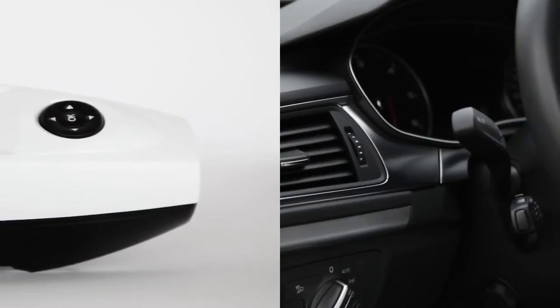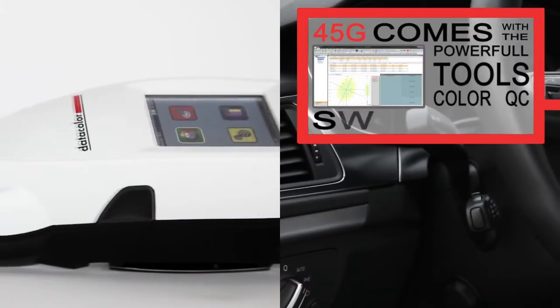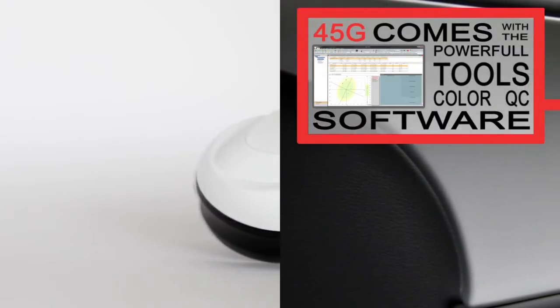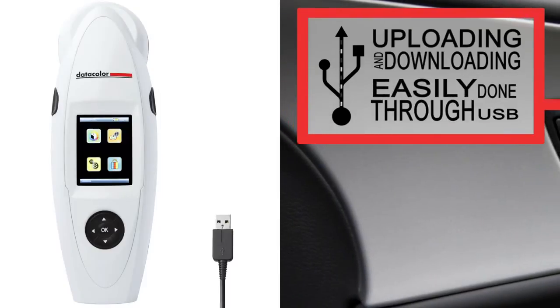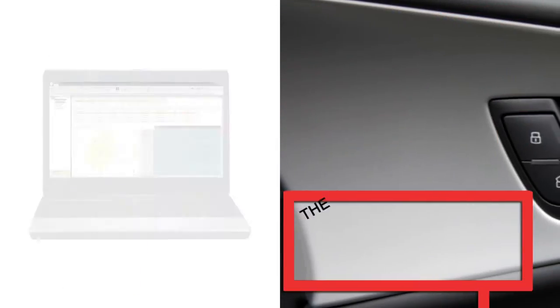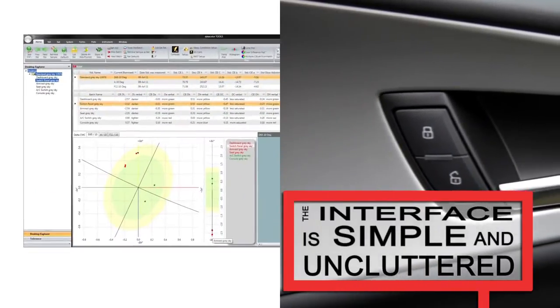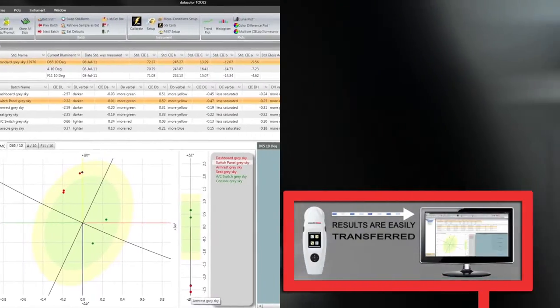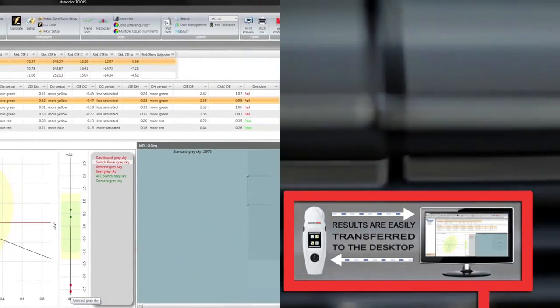Great hardware needs great software, which is why the 45G comes with the powerful ToolsColor QC software as an integrated part of the Datacolor 45G system. Uploading and downloading to the instrument is easily done by the push of a button through USB. The interface is simple and uncluttered, as the 45G appears as an external drive on the Tools desktop. Results are easily transferred to the desktop, while new standards are transferred to the 45G with a simple right-click menu.